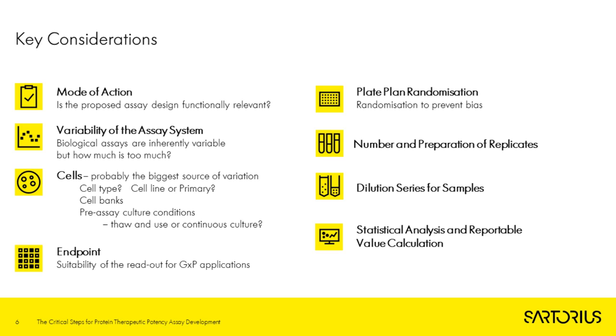So during the bioassay development process, there are some key considerations aside from the general assay development considerations like cell seeding density and incubation times, that we need to think about when we're developing potency assays. And I've selected a few of these to discuss in more detail. This is not an exhaustive list of everything that you need to consider, but it's a starting point for this discussion. So the first one is the mode of action.